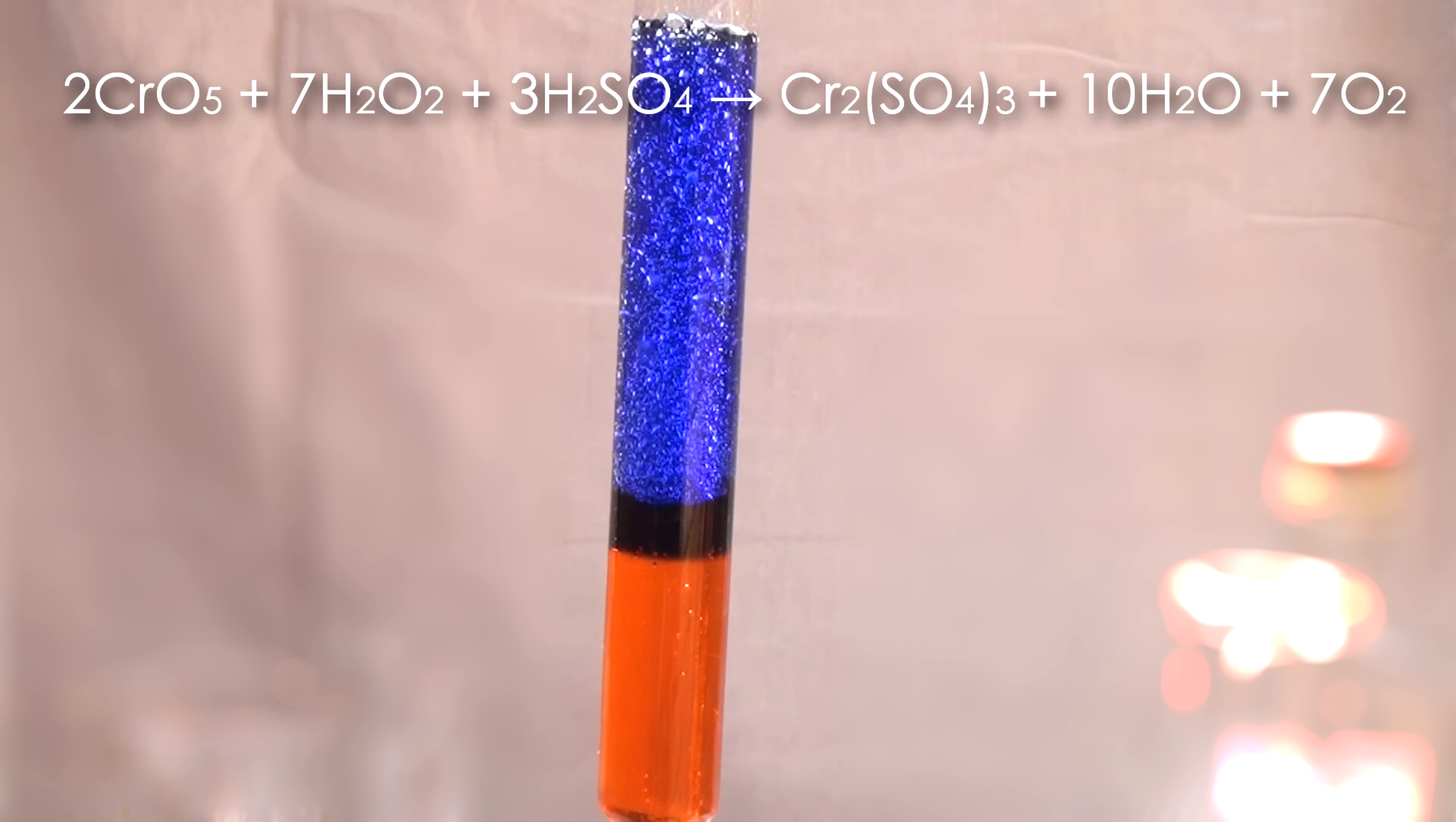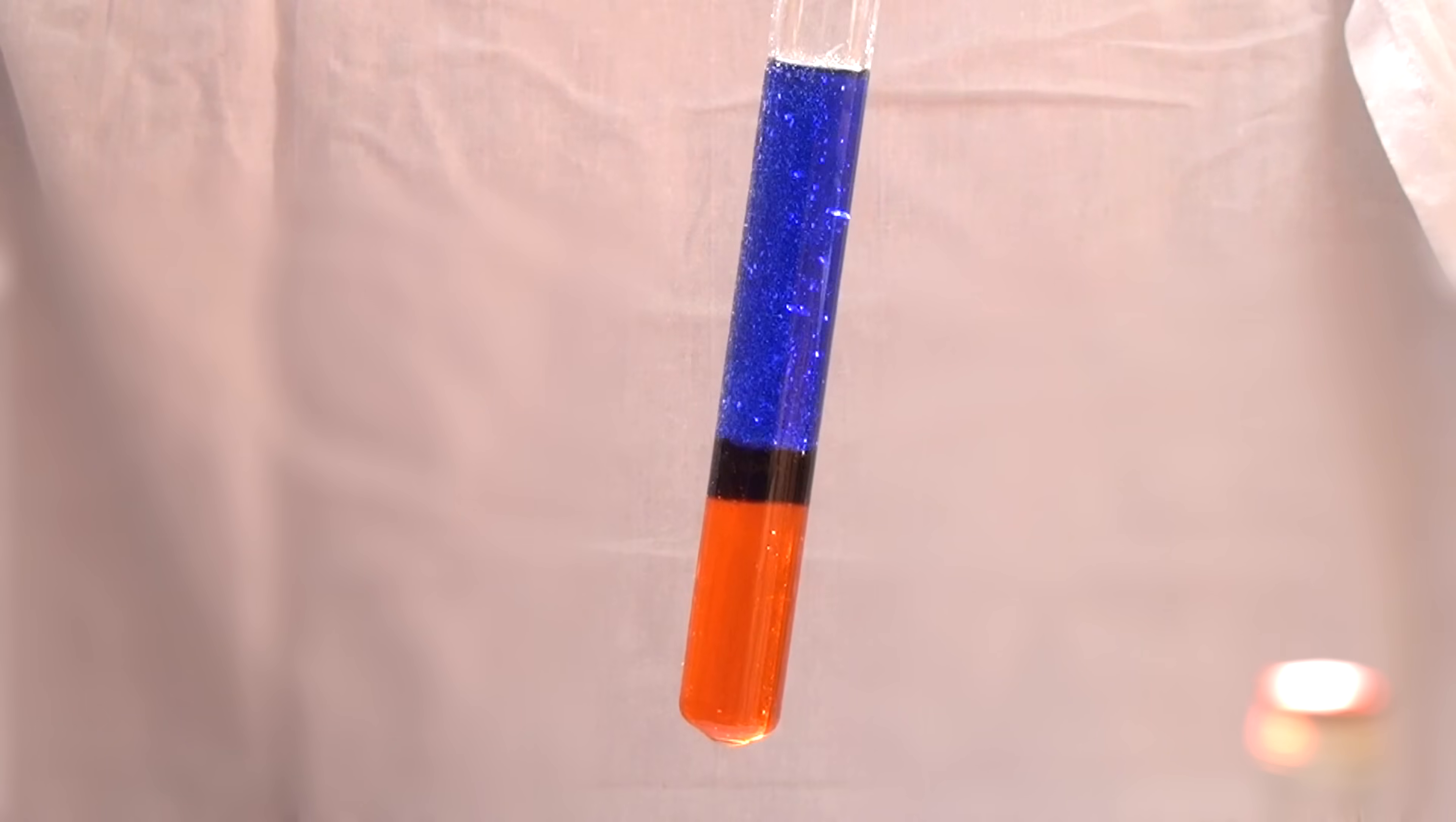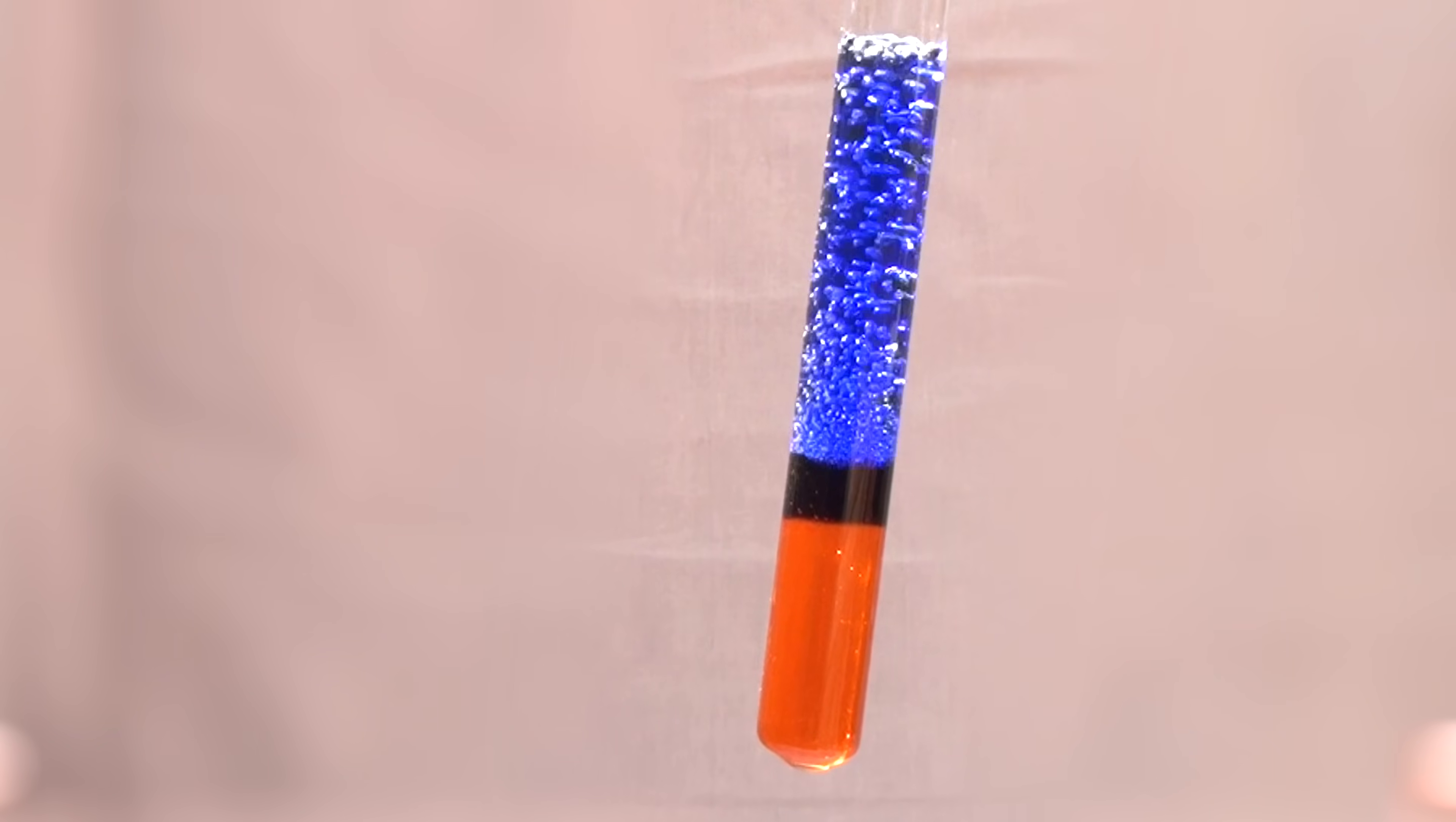When potassium dichromate and hydrogen peroxide react in acidic environment, an unstable compound is formed, chromium oxide peroxide. That compound decomposes immediately in an aqueous solution and gives the middle layer of the liquid this dark color.